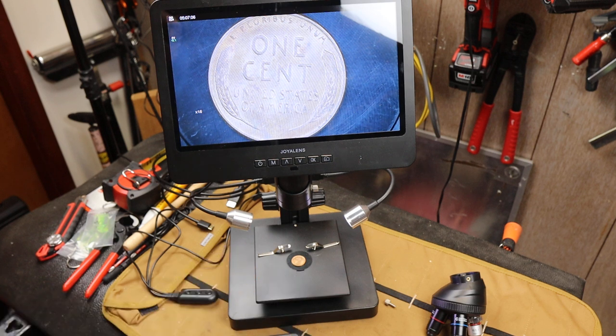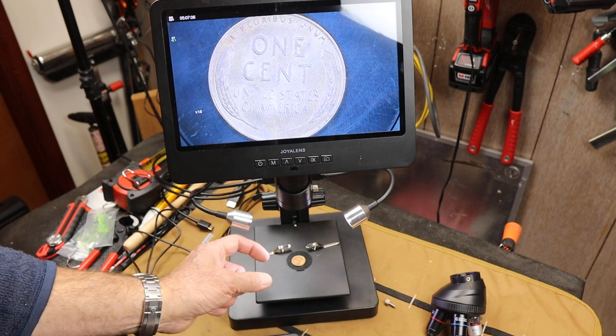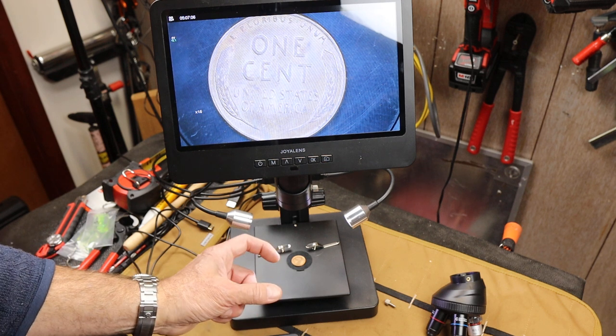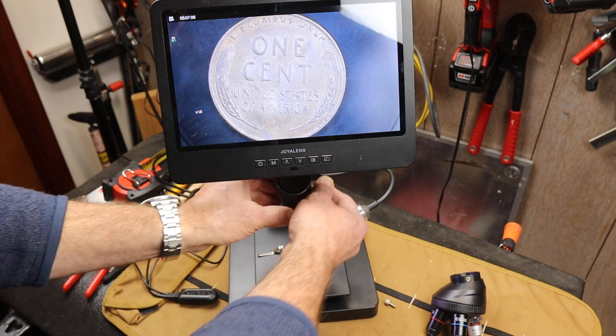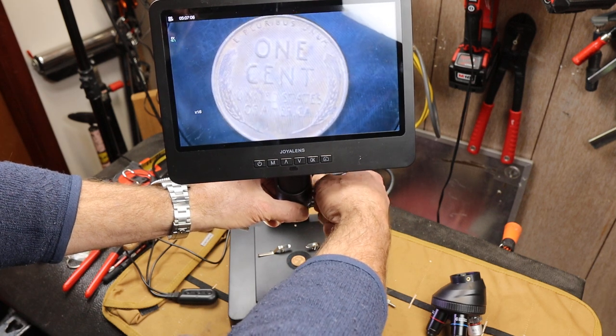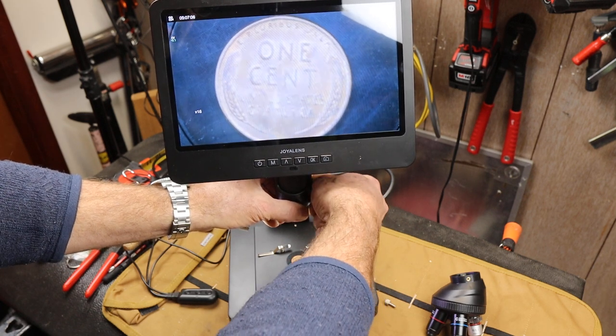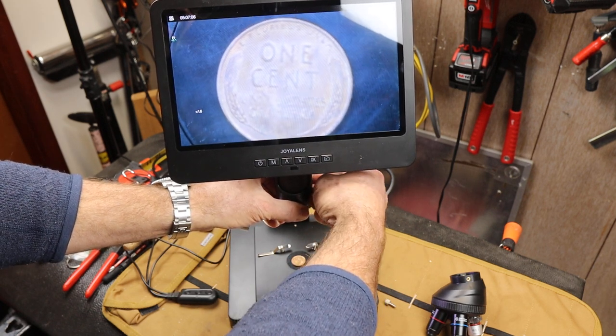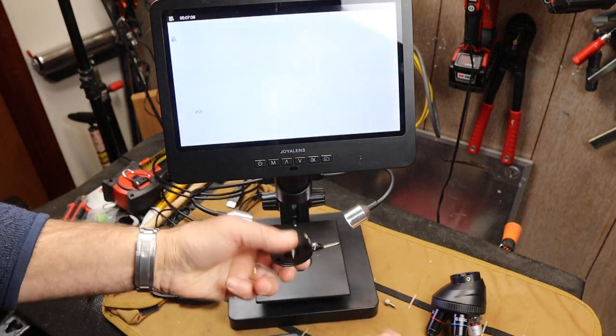So I've got tremendous capability with basically a large, you know, 18x on a larger item. But if I pop this thing out, and then there are two set screws, I was only using one knowing I was going to pull this out.